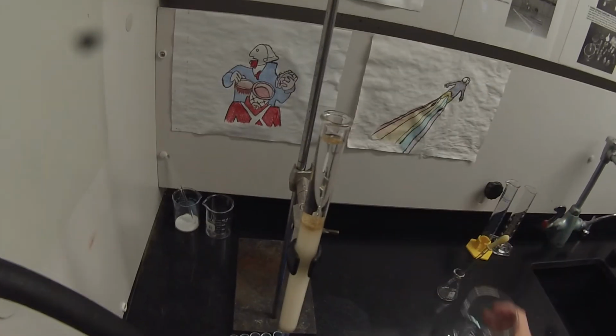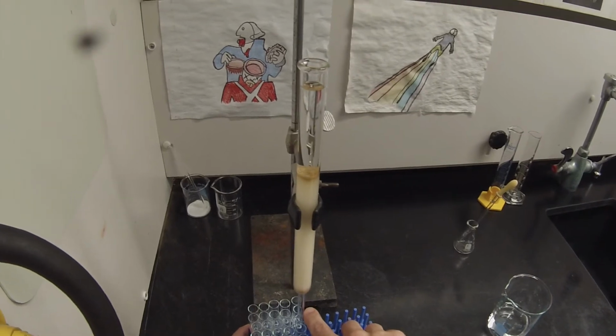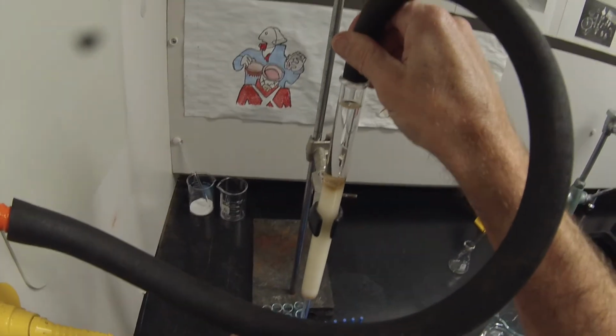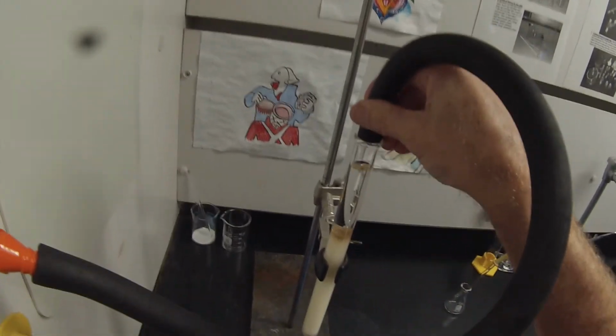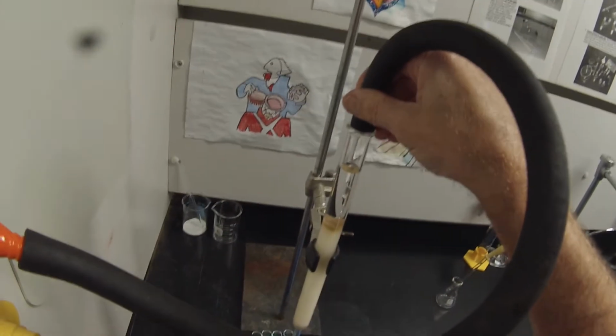The reason I'm rinsing off the tip is if there's a little bit of vanillin there, I don't want it to stay there, and then I'm collecting cinnamic acid and all of a sudden that vanillin lets loose and gives me contaminated fractions. I may not get perfect separation. There may be some fractions that have both in them, but at least we hope we have some pure fractions.